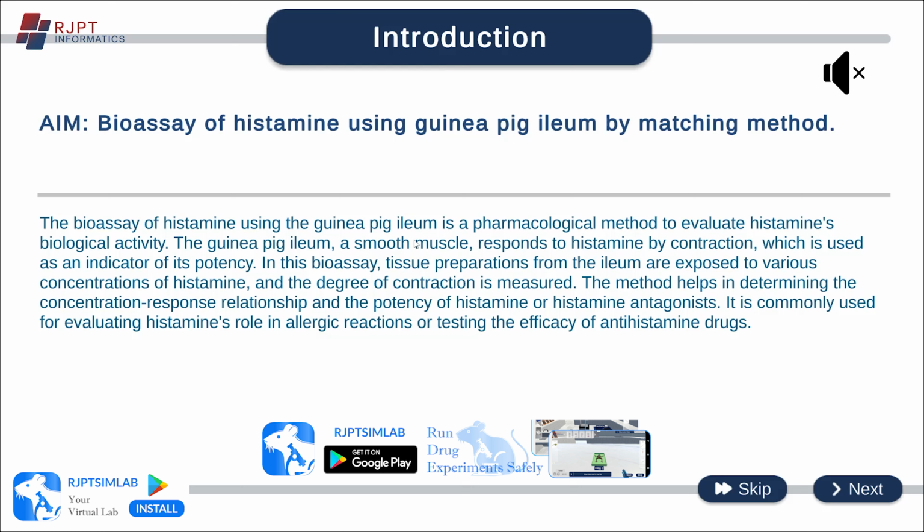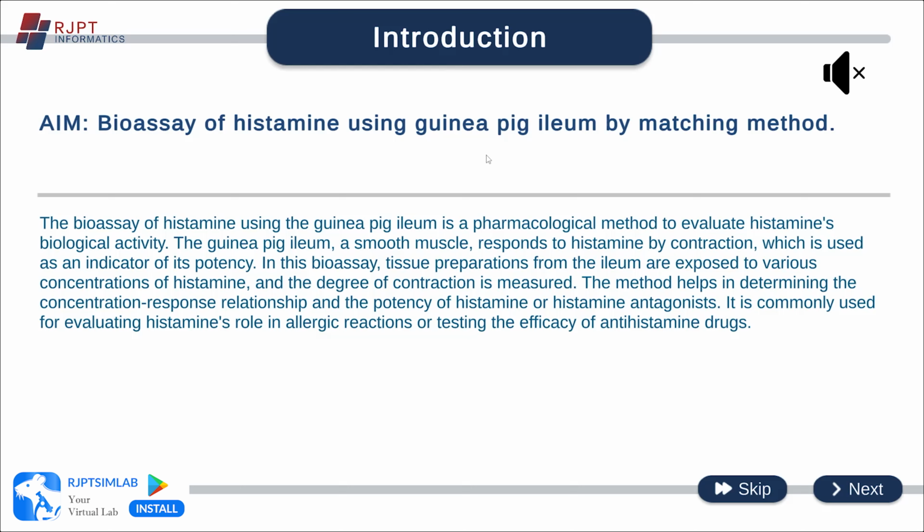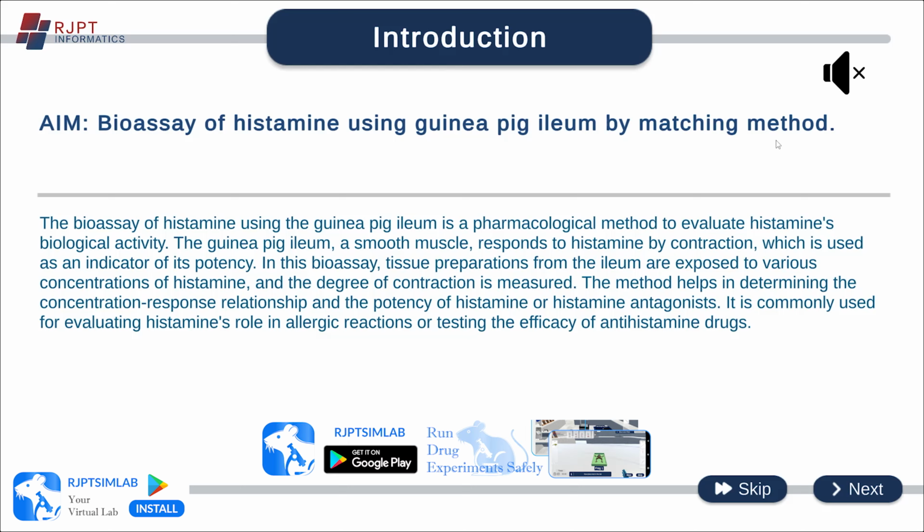In this video, we will study the bioassay of histamine using Guinea Pig Ileum by the matching method. Now, let's start with the video. But at first, let us see the description of this experiment.